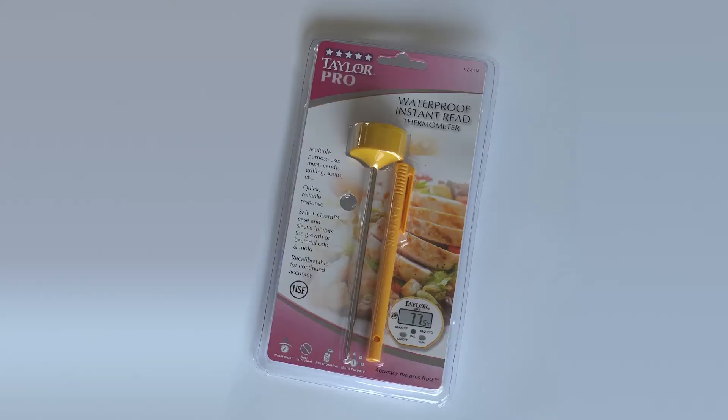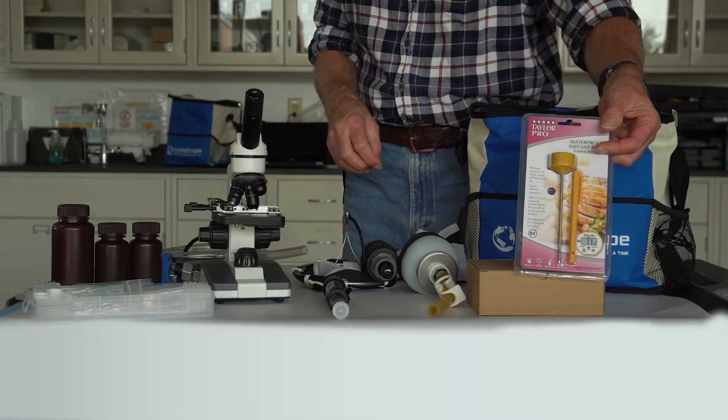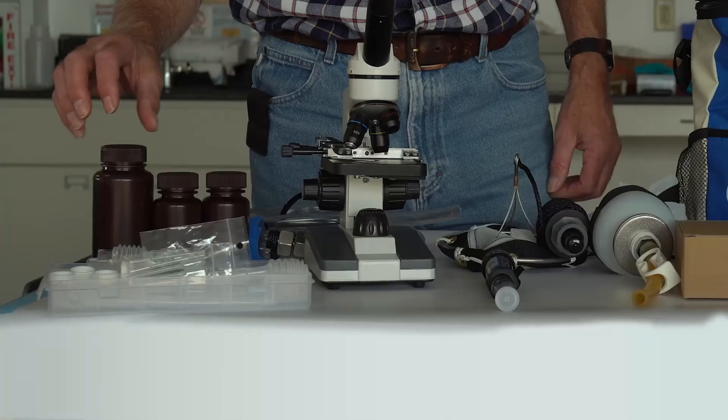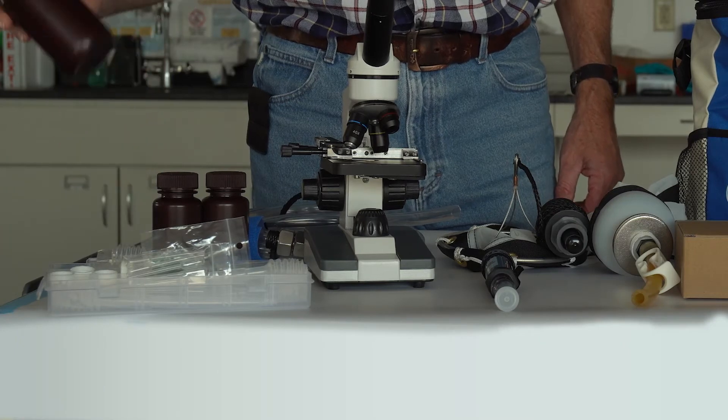The digital thermometer is used to tell the ambient temperature of the water sample. The kit comes with multiple collection bottles that come in two sizes. These will be used to store the samples before you analyze them.